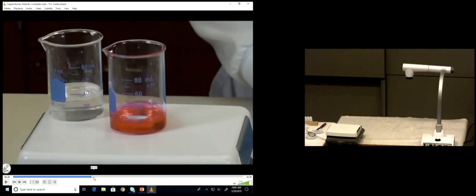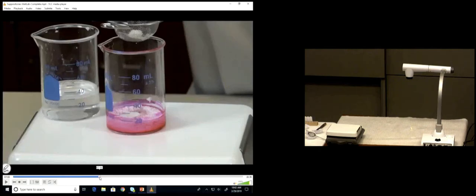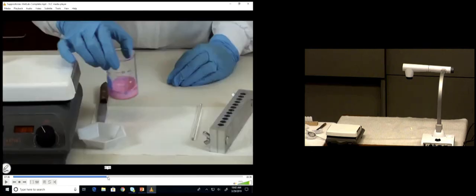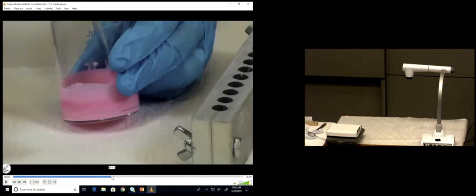Anyways, get that stirring as fast as it can without going crazy, and then you sift in your drug, just like Judy did in the video, okay? Don't dump it all in there, but make sure the stir bar does a good job of getting all of that stuff dispersed in there, okay? Then you're going to take it off of there, remove the stir bar, and then you're ready to pour, okay?